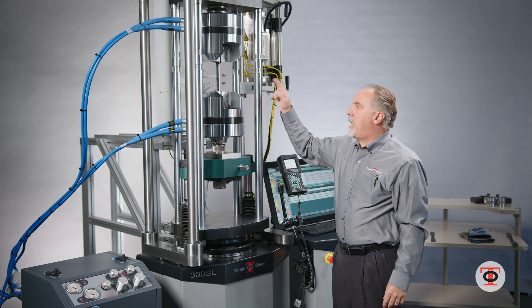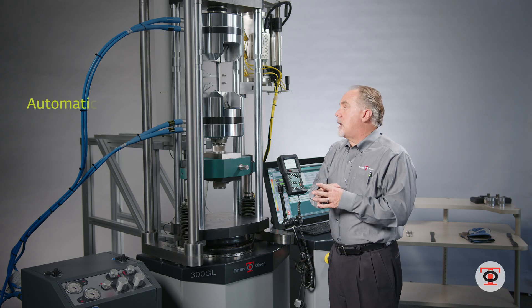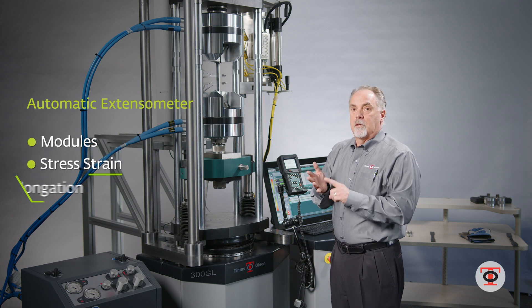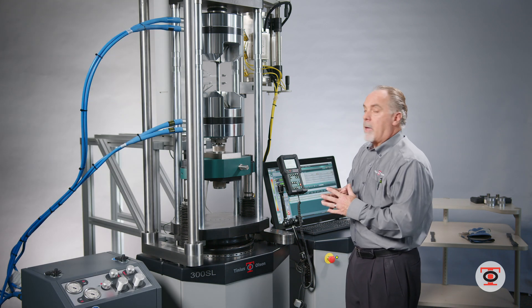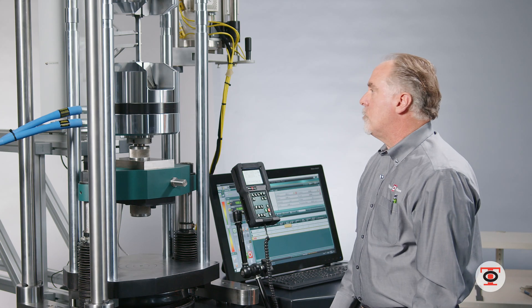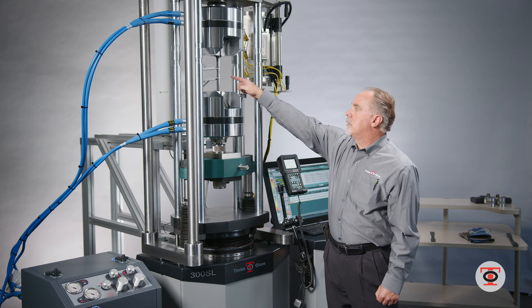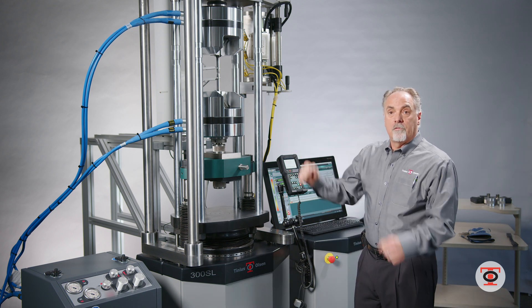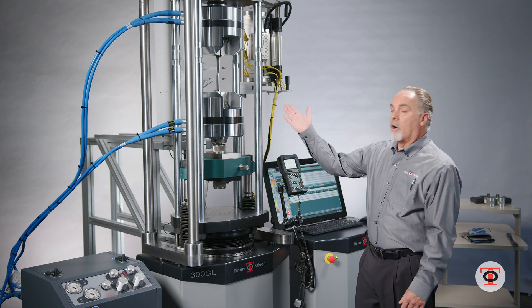This particular machine has an automatic extensometer — it will engage, stay on through failure, and open up after the test is done to give you your modulus, your stress-strain, and your total elongation, all automatically. Now it will start to load and pull that specimen apart. You'll notice the material starting to neck down — that's where it's going to break, right in between the gauge length. The specimen broke and the arms open up.